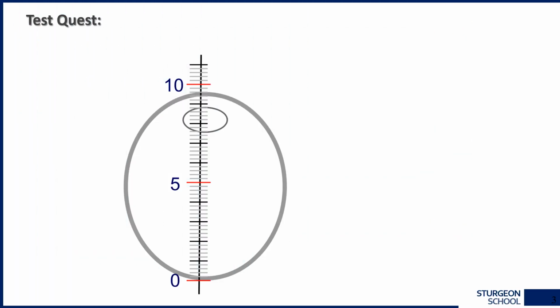In order for you to check yourself if you have understood everything correctly, we propose to take a little test and determine the polarization coefficient of the schematic oocyte, which is presented now on the screen. We purposely used the schematic image to make it easier for you to identify the measurement points, and we got matching results.